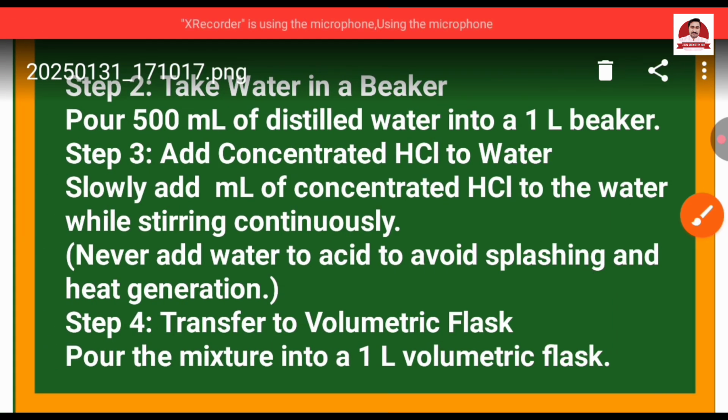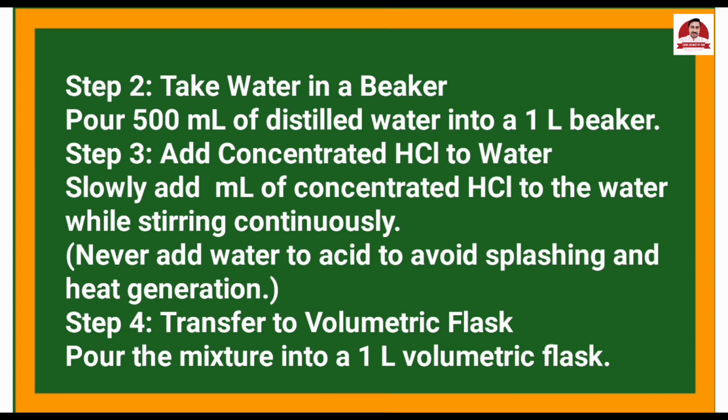Now the next step is we take water in a beaker.